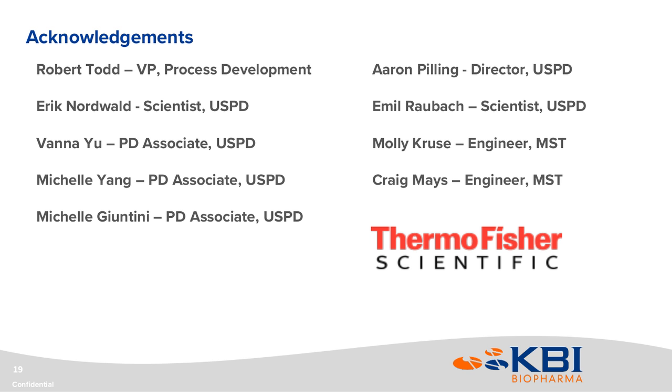And again, I'll mention it, it's fairly new. Like I said, we're about a year and a half into this from a development and GMP perspective, but transitioning out of those single-use systems to stainless for increased material needs from clients, we're pretty new into this problem. I think we have things in place to mitigate risks around it and build a development program for those specific programs that are transitioning out of single use. But that's certainly one that I think will be a challenge moving forward for us.